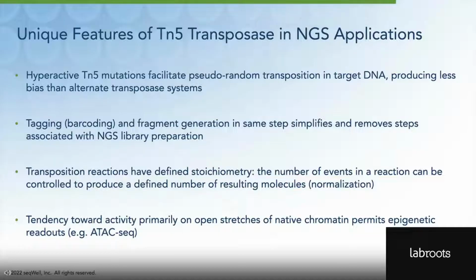Sure. So I think there are a few really interesting properties about TN5 that make it a really versatile enzyme for NGS. Probably the most important is that it's an enzyme capable of binding and inserting DNA nearly randomly in any target sequence, which allows it to be substituted for protocols that need a shotgun fragmentation-like function. Another really interesting property is that it can be functionalized, loaded with different types of payload, which we have turned into the ability to put different sequencing functions into it, such as sequencing adapters.